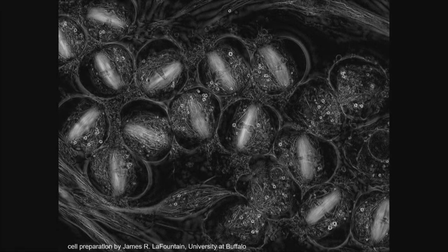So these are microtubules, like we saw earlier, that span between the two poles. The aster that I showed you earlier, in this extracellular prep, is here. The centrosomes are the poles of the aster. They built this structure that's called a spindle, a meiotic spindle in this case. These are the two cell divisions before the sperm forms that reduce the chromosome set. As you know, the chromosomes in the sperm and in the egg are half of what is usual.